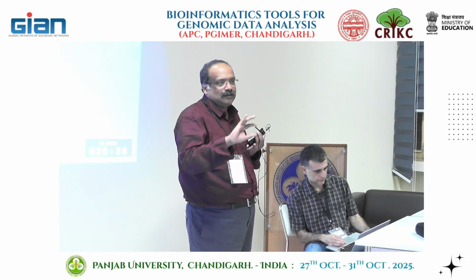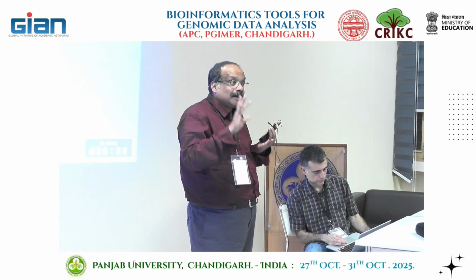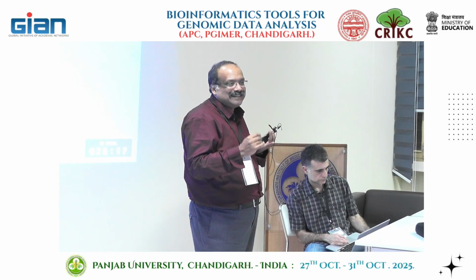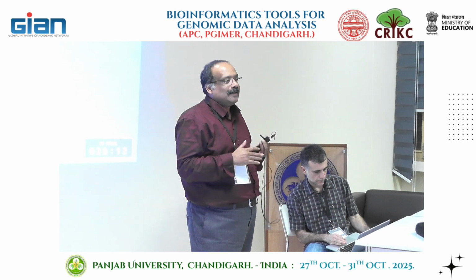And then if you change something, there will be small changes. But again, there is another aspect of it. Any biologically significant changes you should see irrespective of the smaller ones, which actually come and go when you change your software. So those are the two things.